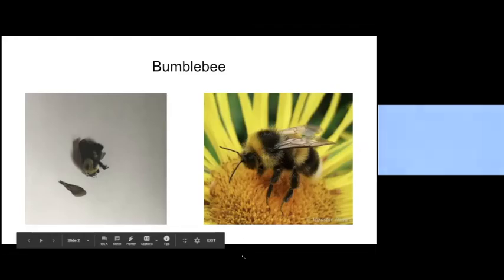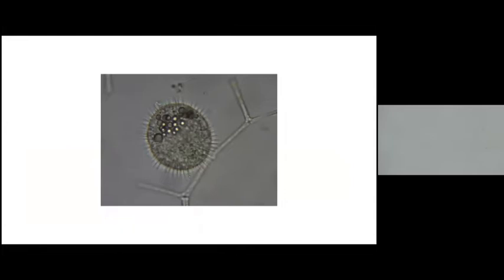All right. So Lydia, if you want to just move to the next picture. I have a microscopic image rather than something I'm going to show you under the microscope. This is just already a picture under the microscope. I want to make some observations here. What do you guys notice about this?